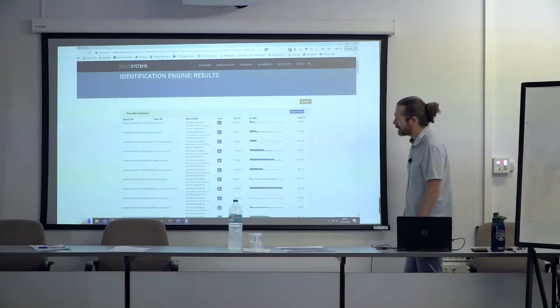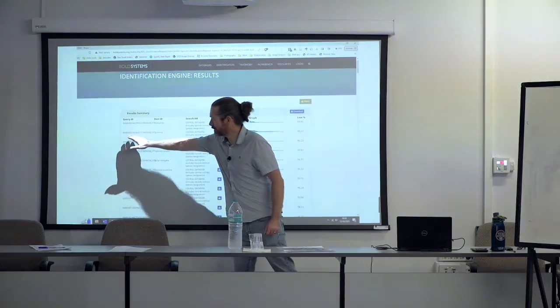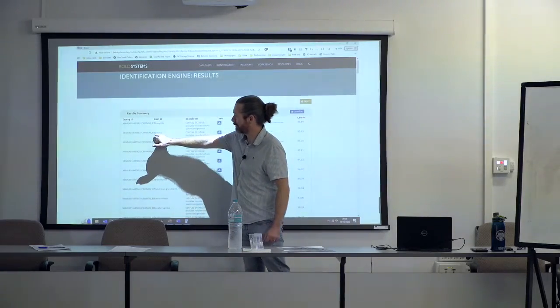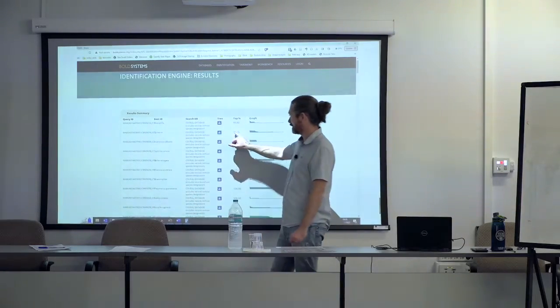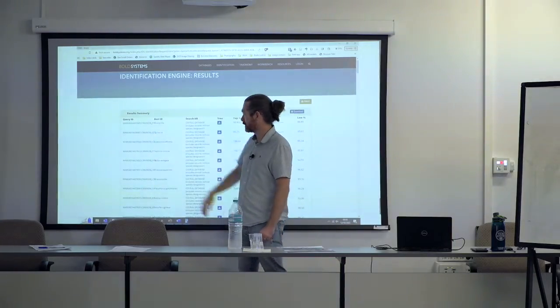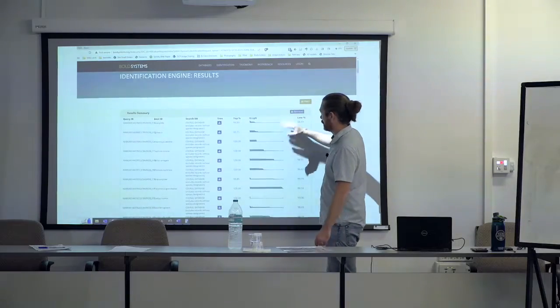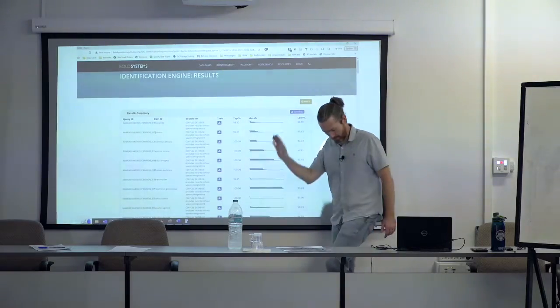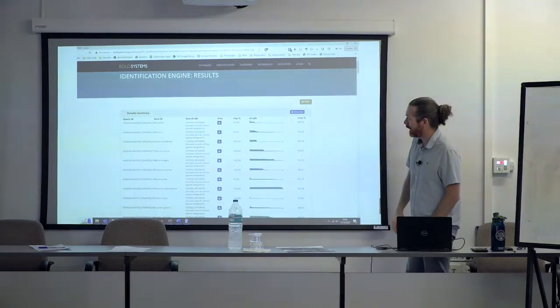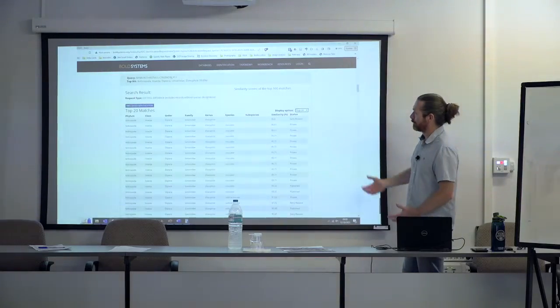You can see actually here, I mentioned that wasp. I think my sample names are a bit too long here, so they're just overlapping. But it's come back with, again, 99.75% to that same genus, but it hasn't given a species designation. It gives you a graph of the top match and the bottom match within the top 20, 50, or 100 hits. And then you can scroll down, I believe, and go to one of those records.